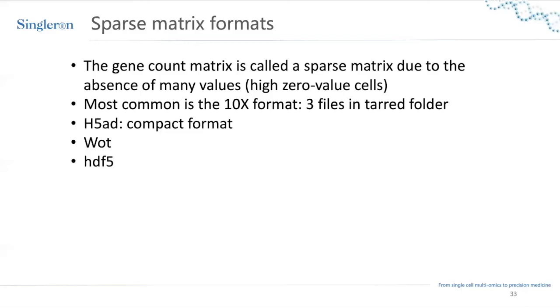As I said, there are more and more tools coming out that are dealing with converting, but usually you'll have to go through an intermediate. So for H5AD, you can convert it in R using one package called SeuratDisk, into an intermediate file format, which you can then read back into R and then go on with the rest of the analyses that you want to do.